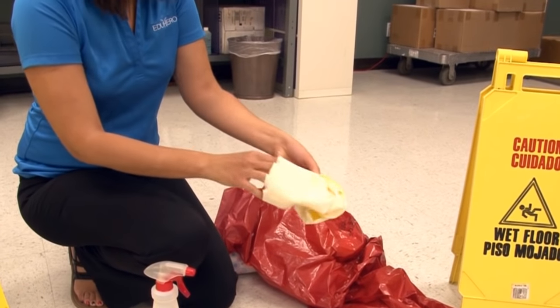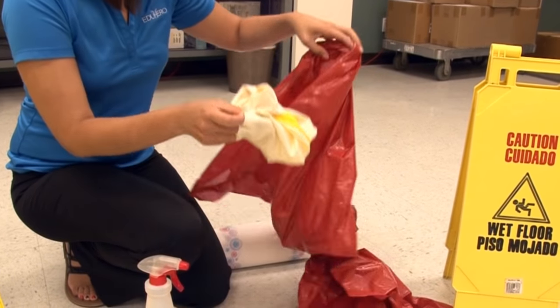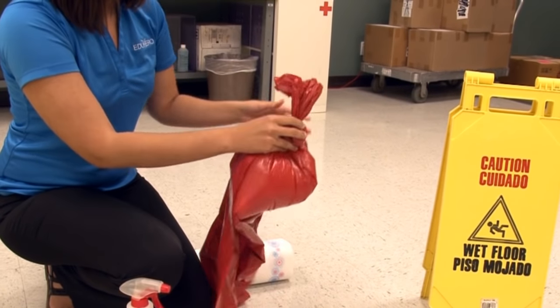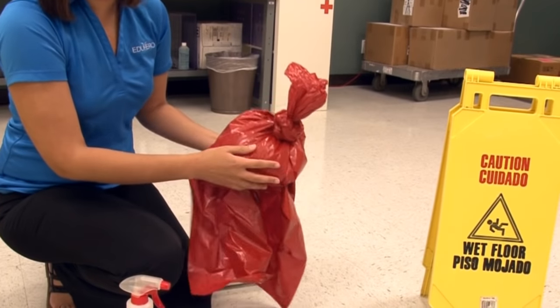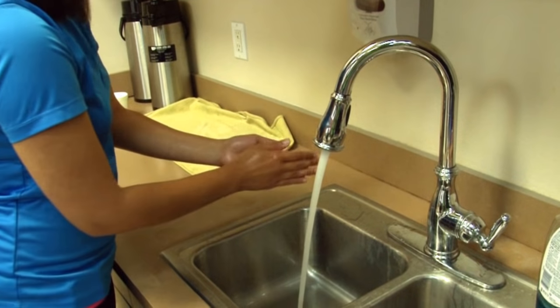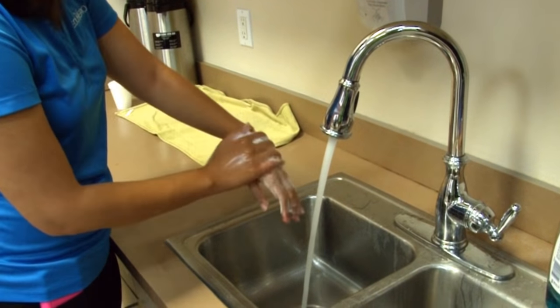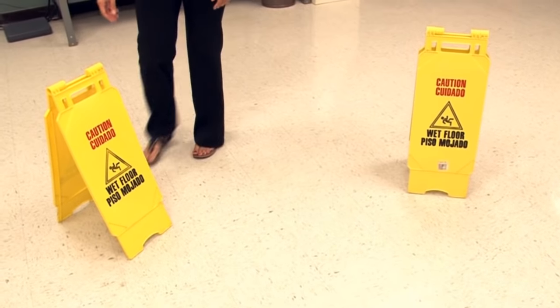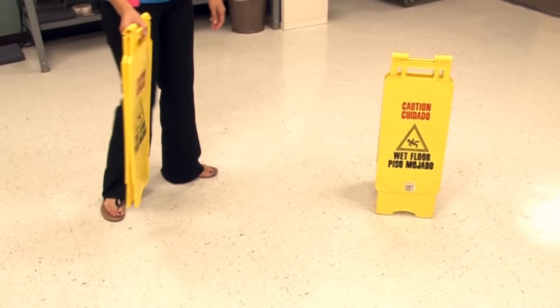Finally, dispose of your third pair of gloves in the biohazard bag and seal the bag for proper disposal. Then wash or disinfect your hands thoroughly. You have safely decontaminated the small blood spill area.